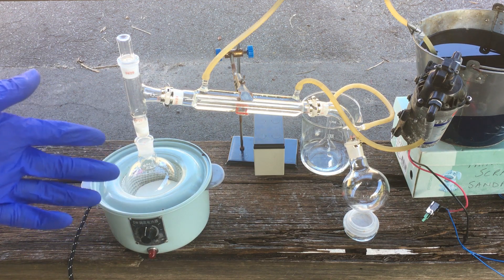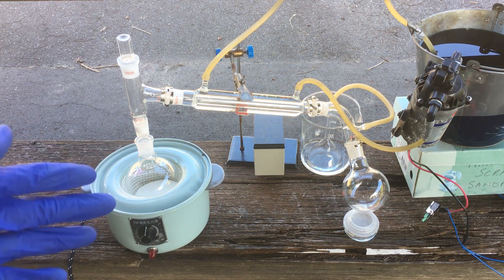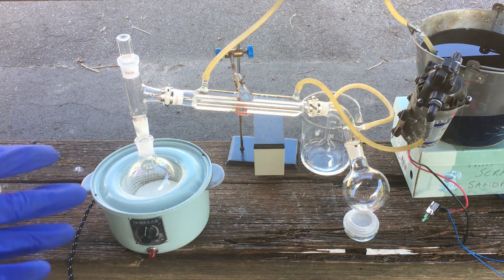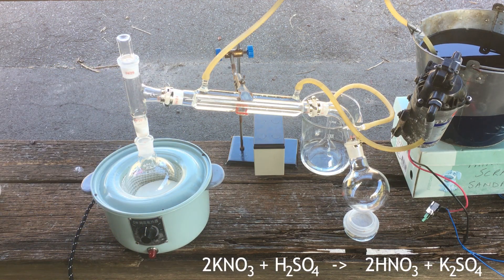The standard method for generating nitric acid in the lab is to react a nitrate salt with a strong non-volatile acid. The best choices are of course potassium nitrate and sulfuric acid, and then upon reacting the two together you can distill off the nitric acid very easily because it has a relatively low boiling point.